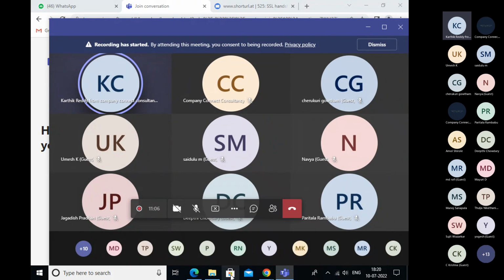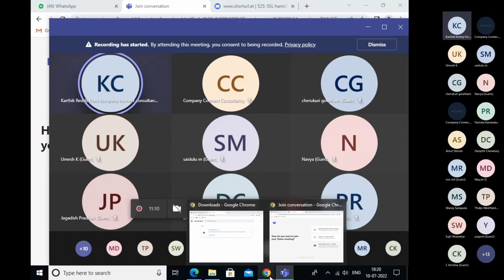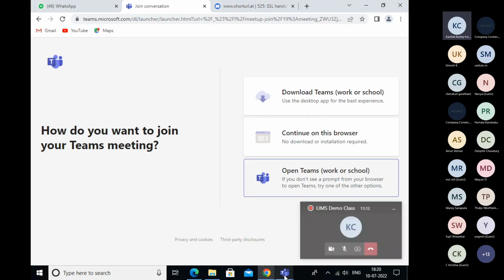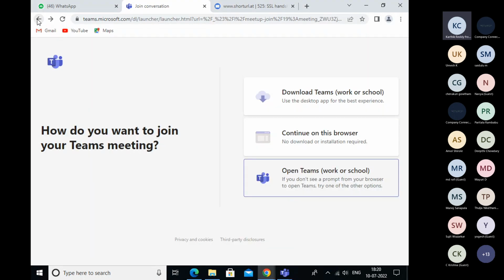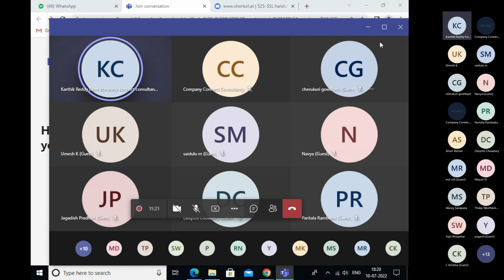So the analyst qualification module has one procedure available for each laboratory, so the people can be trained on that. Those details we will import, I mean by entering manually in LIMS in the initial phase. After that, once the analyst qualification module is validated, then we will do all the analysis. Personal training records, everything is generated in LIMS only.